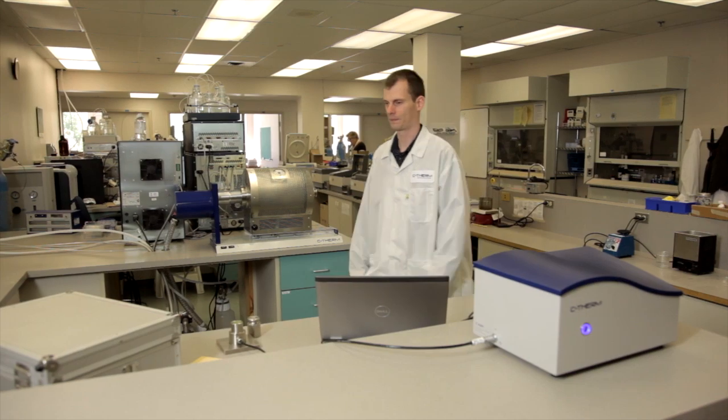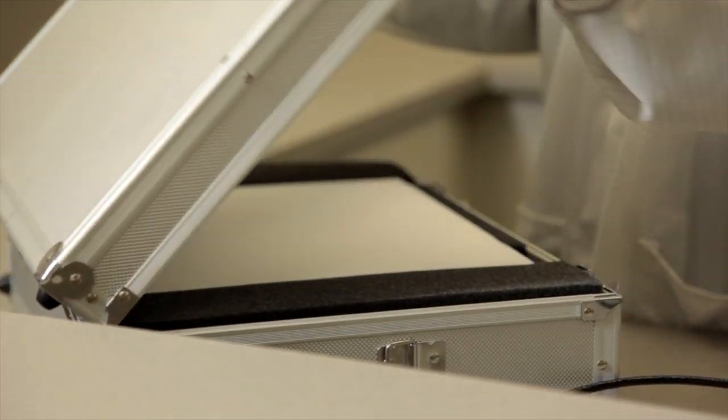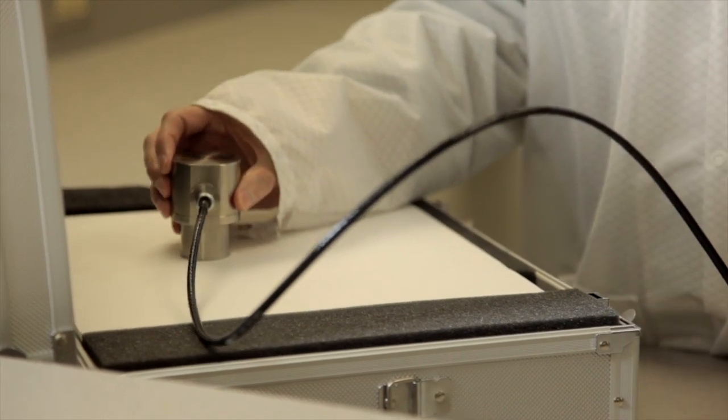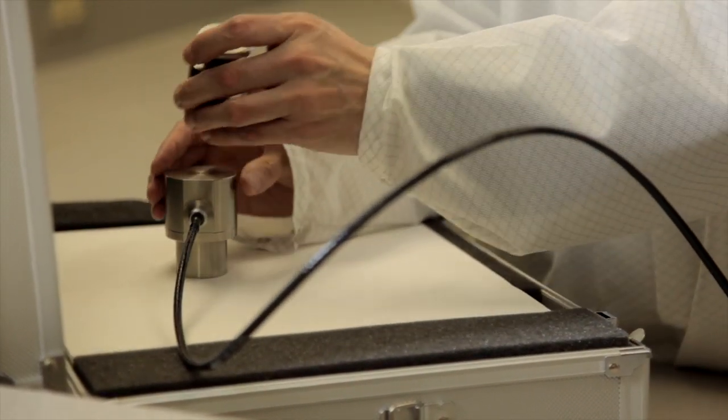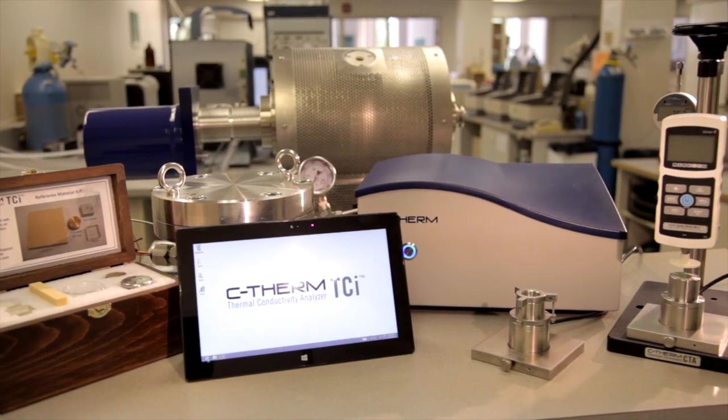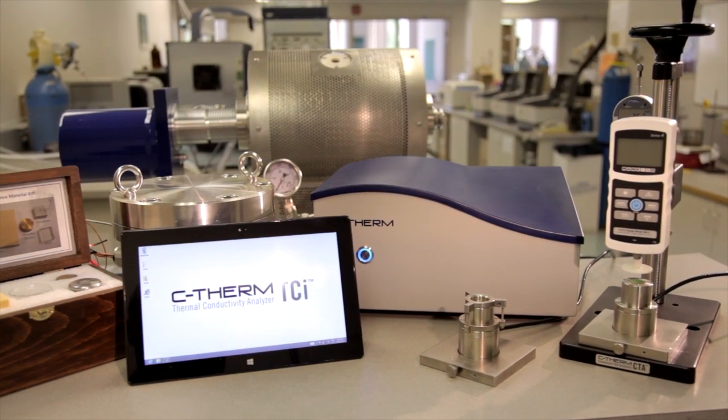Testing solids is simple. Just place the sample on the sensor or invert the sensor for larger samples. With the auto test function, you can simply click and walk away. One of the TCI's most exciting features is the ability to add a variety of testing accessories.